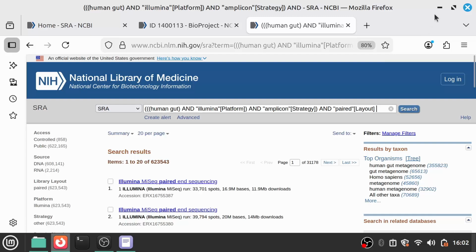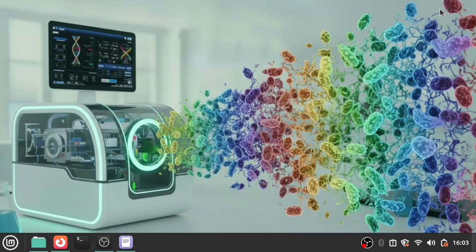So to summarize, in this lecture, we first demonstrated how raw NGS data can be obtained from sequencing service providers or companies. We then explored different ways to search the SRA database, including accession-based search, keyword-based search using Entrez, phrase searching using quotation marks, and Boolean operators for advanced query building. Finally, we introduced the advanced search builder in SRA and learned how to apply structured filters to refine dataset selection.